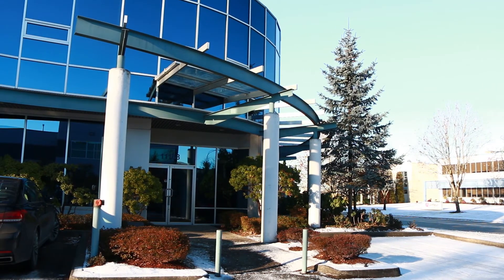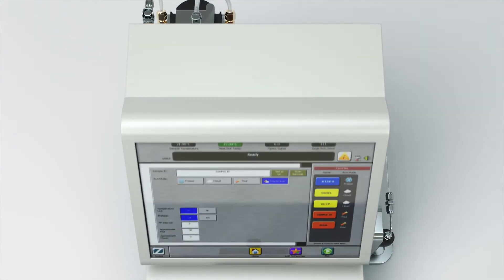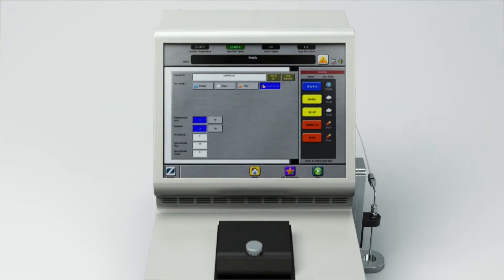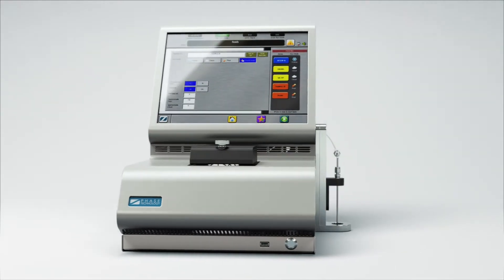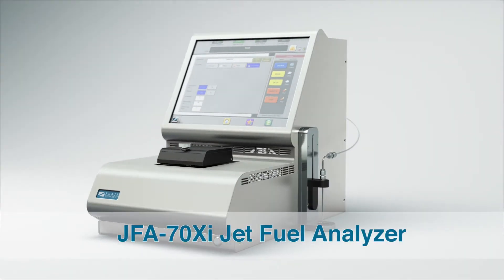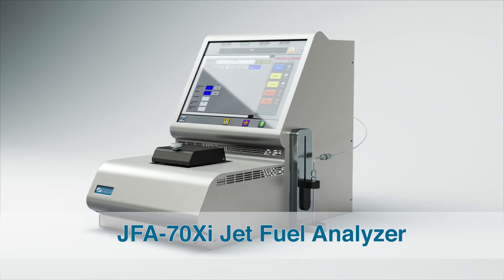After bringing you the successful 70XI series, the world's easiest to use analyzers, Faze Technology is proud to present the JFA 70XI, the world's first and only 3-in-1 jet fuel analyzer.